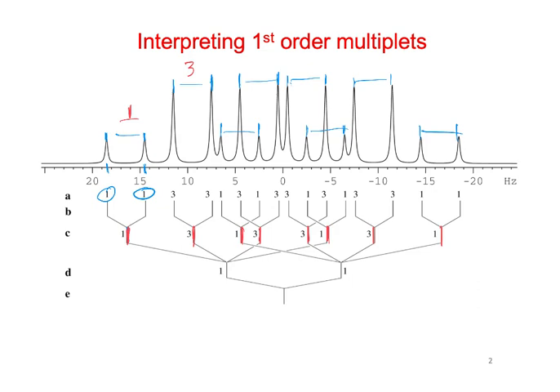So if that was 1, this is 3, this is a 3, these two are 1: 1, 3, 3, 1. So if we have a 1-to-3 ratio, that means that we have to have some component of a quartet. Okay, so then we can bring those together, right? So this shows all of those coming together into quartets.